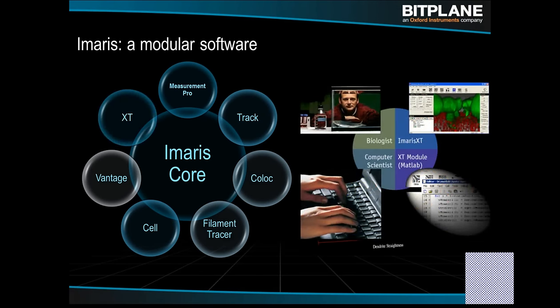And then there's the Imaris XT module, which is a little bit hard in a quick description to fully convey what it is. It is a programmable interface, would be the simplest description, but it is also a package of add-on plugins, essentially. We call them extensions, that come with Imaris that were developed by Bitplane to extend the functionality. But essentially what it does is allow Imaris to communicate with some external program so that you can write custom functions for Imaris. And that could be in MATLAB or in Java or Python, or anything that can bridge to MATLAB or Java or Python as well.